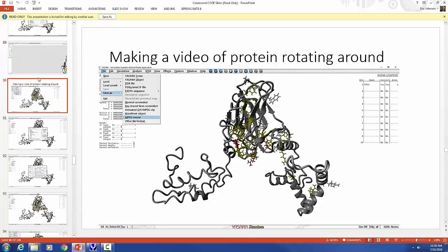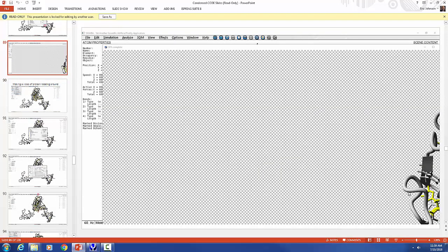But then once you bring it down to the regular size, see how you have pixelations here a little bit, but then once you make it smaller, then you're going to have a more high resolution image.